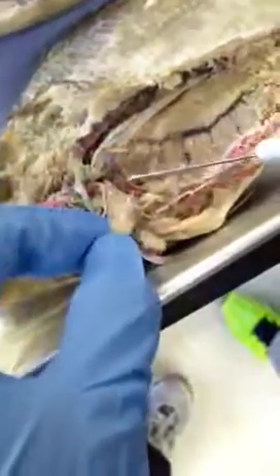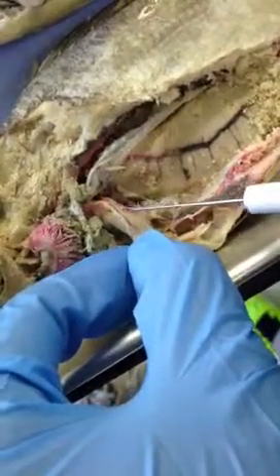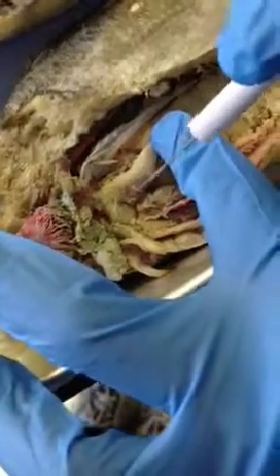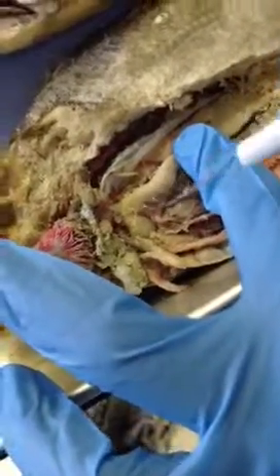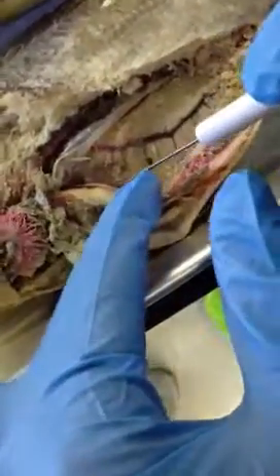Under the fundic portion of the stomach, because this is the pyloric portion, we have the ventral gastric arteries right under the stomach. And then we have the left and the right gastric arteries. The right comes off the right side of the stomach, and on the left side you would see an artery, but sometimes it hasn't been injected properly and just moved. This would be the right gastric artery. And under it, like we said, the ventral gastric artery.